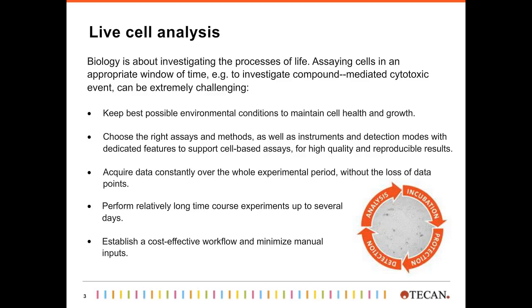Then you need to acquire all that data constantly over time, and you should not lose any data in between. So the very well-known overnight gaps in a kinetic measurement can be really critical, and you can lose important information. Unfortunately, the time courses are relatively long, so more than 24 hours is standard. Up to several days is necessary to investigate biological processes.